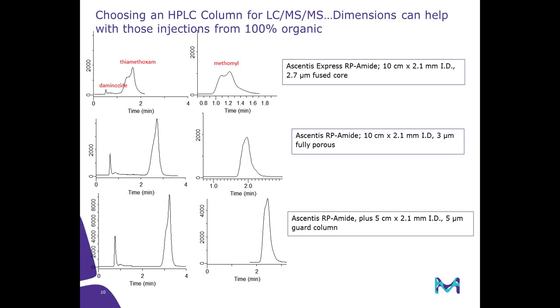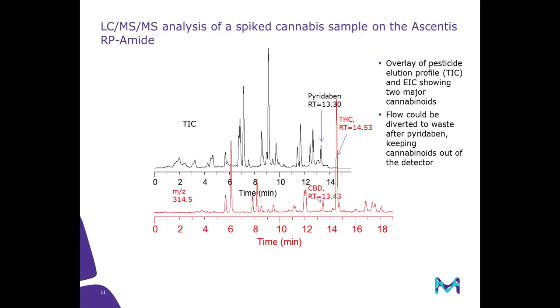And using a guard column is a really good idea anyway when you're running these really messy extracts. It's going to increase the life of your more expensive analytical column.